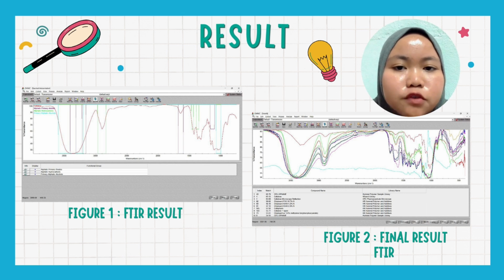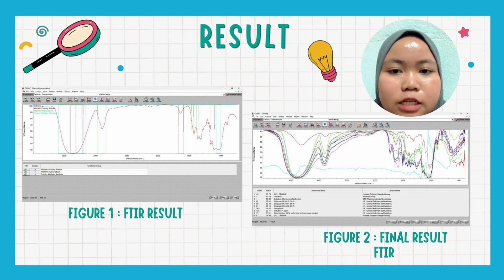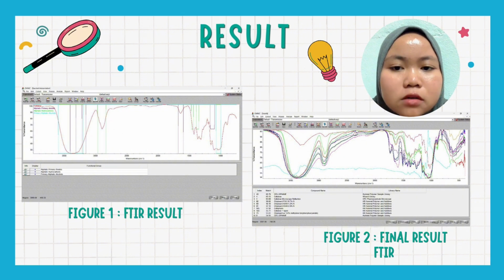Detailed analysis involves identifying peaks accurately, verified with reference spectra, comparing peak intensity with known material, and using software for peak integration, concentration-based analysis, and deconvolution for improved analysis. That's all.